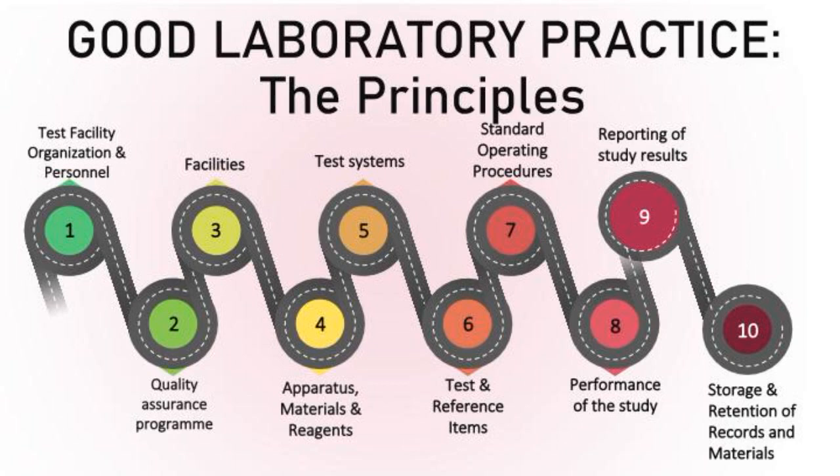Meanwhile, the third principle, the facilities, focuses on the issues and requirements of the premises or buildings where the whole organization of the test study is being carried out. The fourth principle is pretty straightforward. This section provides guidelines on the management of the apparatus, materials and reagents involved in the study.